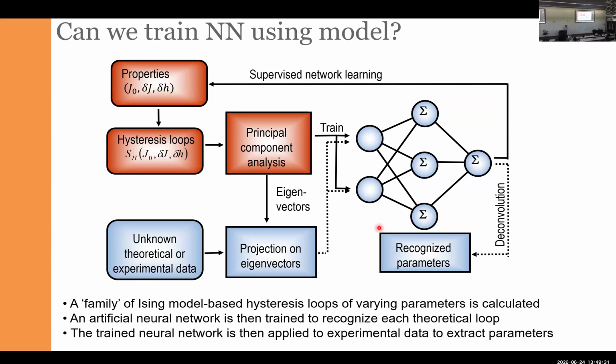Now, the last thing that I want to show you about the spectral data is how can we use machine learning to connect the spectral data to the theoretical model. So this is very complicated because if we have a good model that can be expressed as the analytical solution, we should just fit the model to the data.